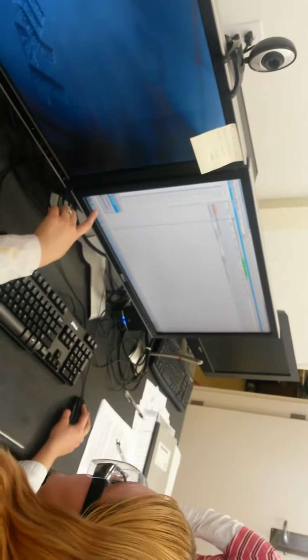Over here, this is what it's going to look like when you go to the data analysis tab. You need to open this up and then go down to caffeine D to today, which right now is still running, so it's not going to show. But you're going to go to the one that says 422, and when you open it, you can see that's my name, and that one's yours, and that's the one you print. This is the standard. And that's all we need to print for HPLC.